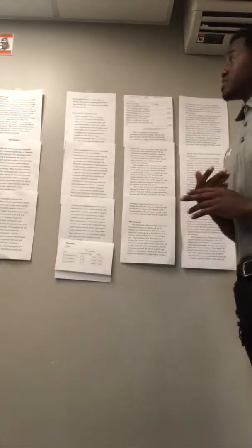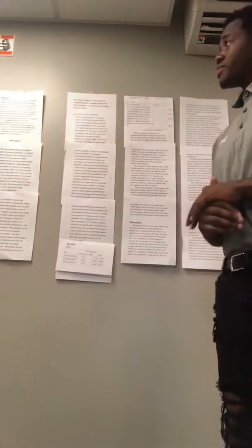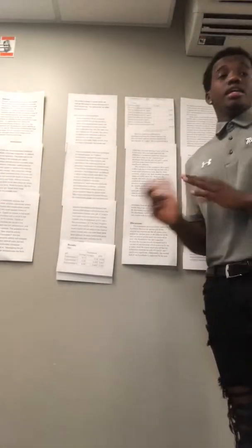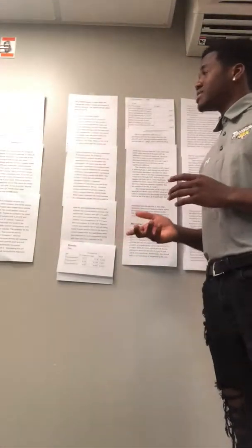I first would like to talk about trypsin and explain how it works. Trypsin is an enzyme that breaks down protein by the use of hydrolysis. It is also found in the small intestines of humans and animals. Trypsin digests protein in the diet.